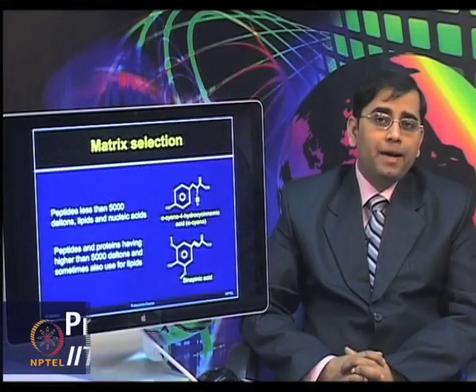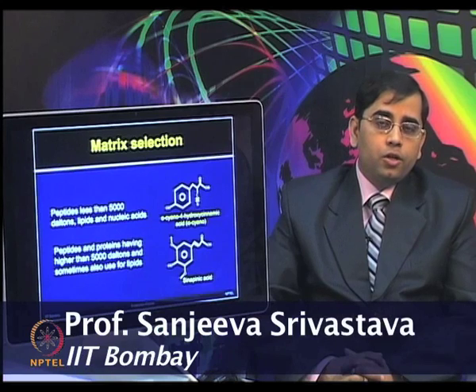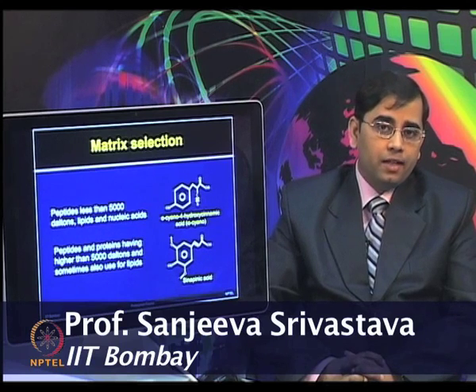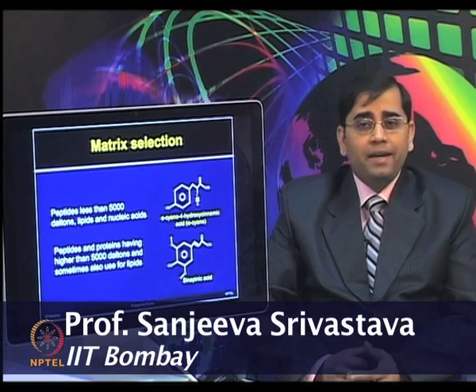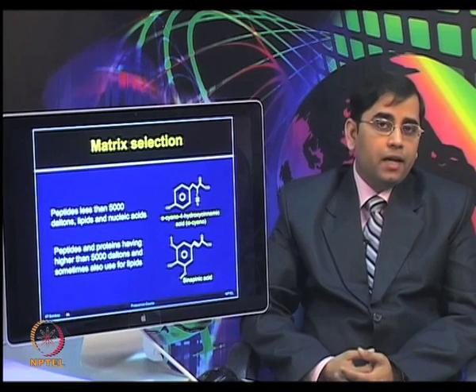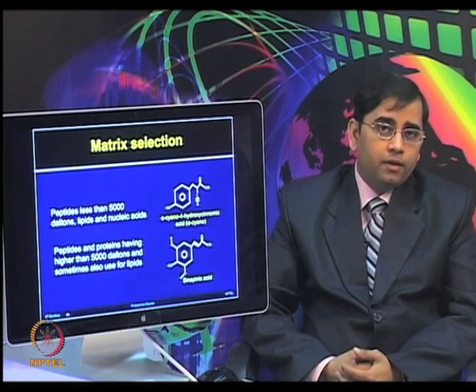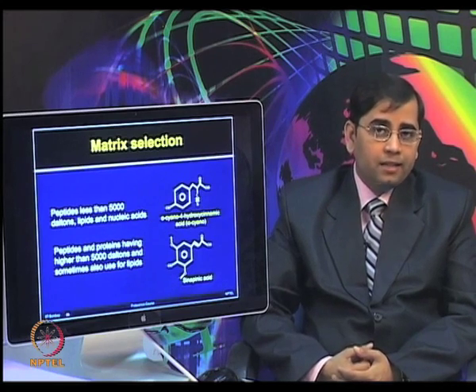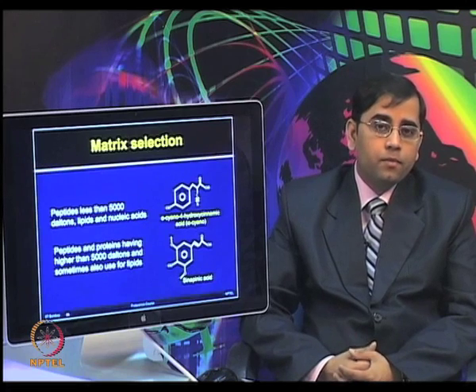Let us first talk about matrix selection. The important step in MALDI TOF analysis is selection of the appropriate matrix for the sample. The matrix selection mostly depends on the molecular weight of the target to be analyzed and often the type of application which you intend to do by using these instruments.